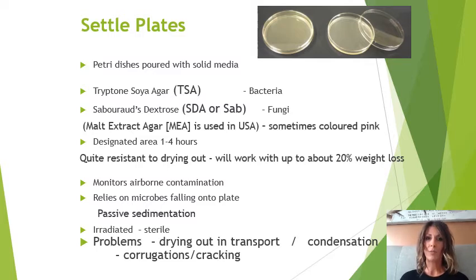We have a maximum time limit of 4 hours for that. It used to be that in 1981, the Parenteral Drug Association recommended only 30 minutes for plate exposure, but more recently other guidelines have increased that to a 4-hour recommendation. That's because 30 minutes probably isn't long enough to get a great sample. So if we expose it for a longer period of time, we increase the sensitivity of the method. However, it's been capped at 4 hours because we didn't want to reduce the recovery due to desiccation of the medium.